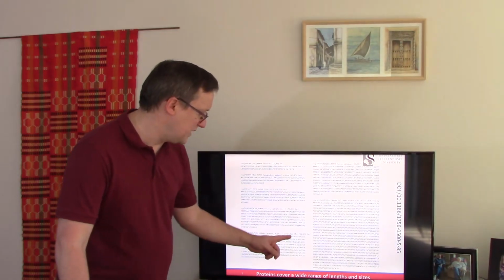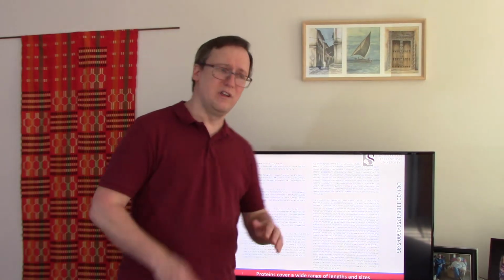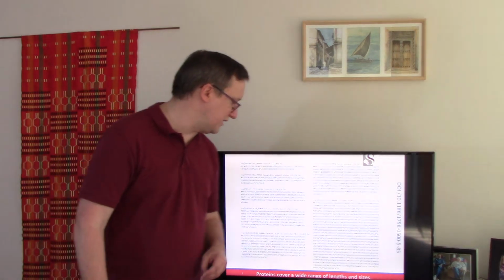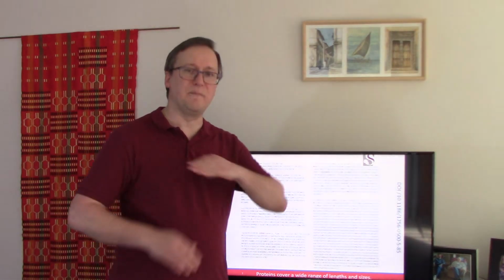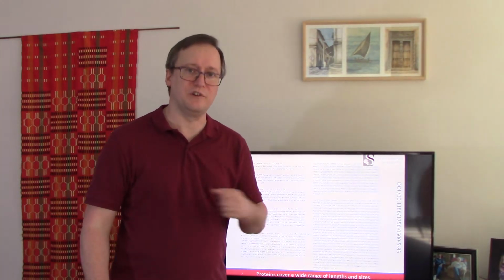And then we get to something that kind of crosses over this threshold. And this is a threshold at present, but it may not reflect where we sit in 2 or 5 years. So for now, I want you to think of something like keratin type 2 cuticular as a bit of a boundary for us. It's stepped over 50,000 Daltons. 50 kDa is a pretty large protein.